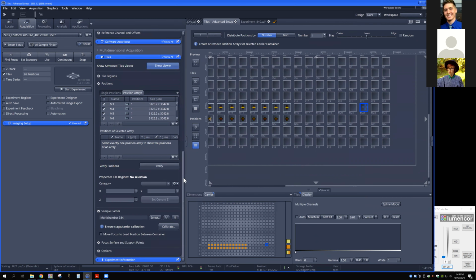Sounds good. So we're going to keep on working with this slide again. If anyone else has material that they wanted to work with, now's the time. It sounded like there were one or two that we might try to work with. And so I hope that this has been helpful. In a way, this gives you basically full exposure to confocal, spectral, area scan, multiplexing, and all of the different multidimensional aspects. So tiling, Z-stack, time series. There are a few things that we haven't done. So in a way, we almost only scratched the surface.